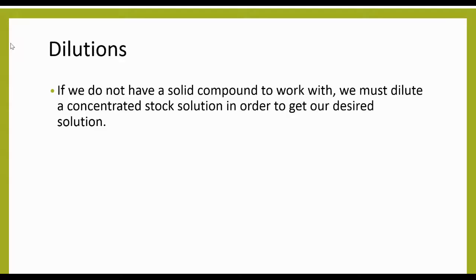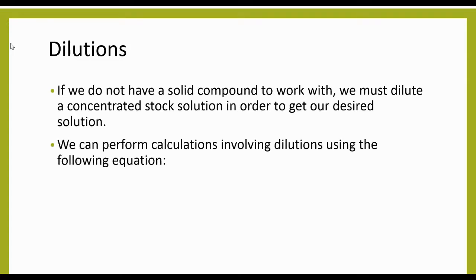Okay, so hi everyone. This video is going to talk about dilutions, which is the process of taking a concentrated liquid and adding more of your solvent to it in order to make it less concentrated. So sometimes we do not have a solid compound to work with. It's not like we're making salt water by dissolving salt. In those cases, we need to dilute a concentrated stock solution in order to get our desired solution.